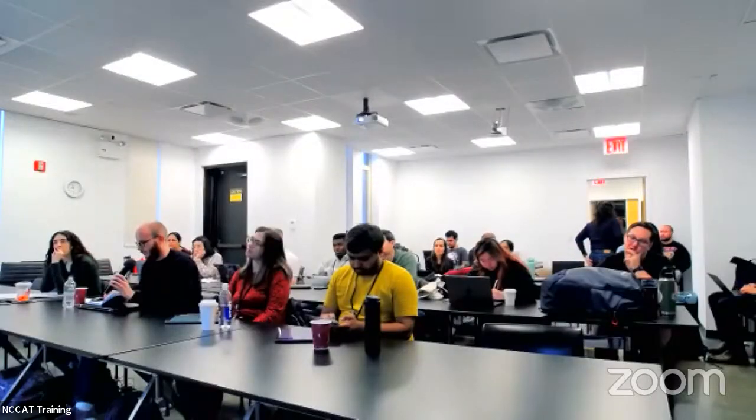Hi, Fred. I just got a quick question about phase plates. In practice, what are the pros and cons of using phase plates? So the pro is, of course, you get this wonderful large amount of low frequency information. And I think the practical way to use a phase plate is to use it with defocus.